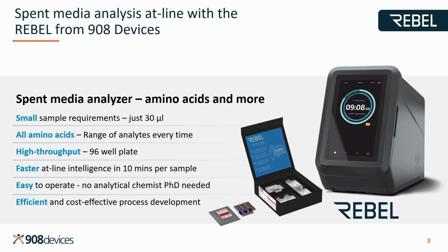is a spent media analyzer that focuses on amino acid analysis, can do some other nutrient analysis as well, some vitamins. But essentially the benefit of this instrument is that it requires very small volume of sample, about 30 microliters or so. It's higher throughput than conventional methods, cheaper, easier to use than the conventional amino acid analysis. So all of the data that I will show for amino acid analysis was obtained from collaboration with 908 Devices.